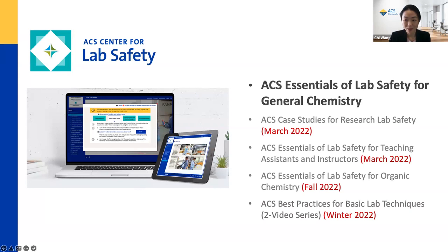To provide everybody with a bit of context, ACS is now offering a robust collection of learning and training resources under the ACS Institute brand that are aimed at our broader mission of advancing the chemistry community. And we will be demonstrating the new ACS Essentials of Lab Safety for General Chemistry today, which is the first of the 6 safety courses currently planned for the ACS Center for Lab Safety.